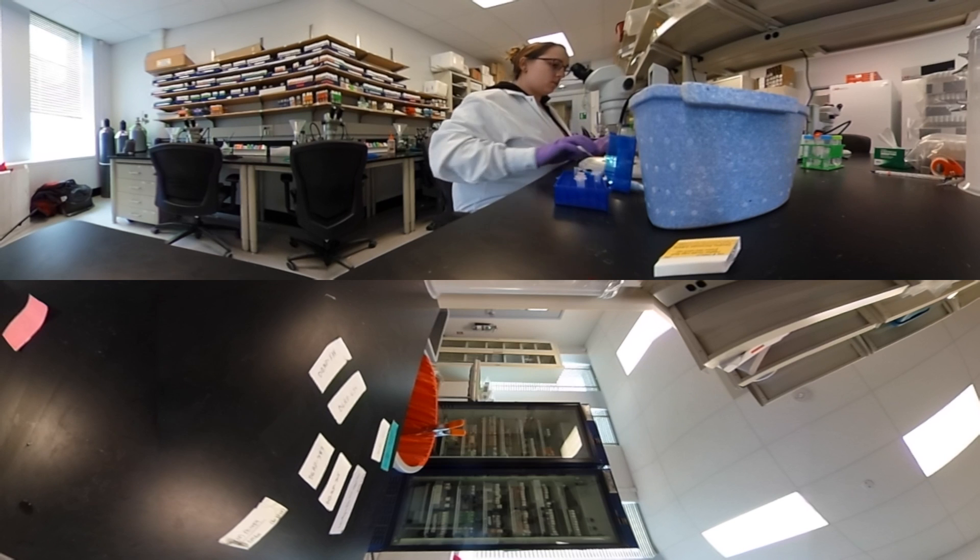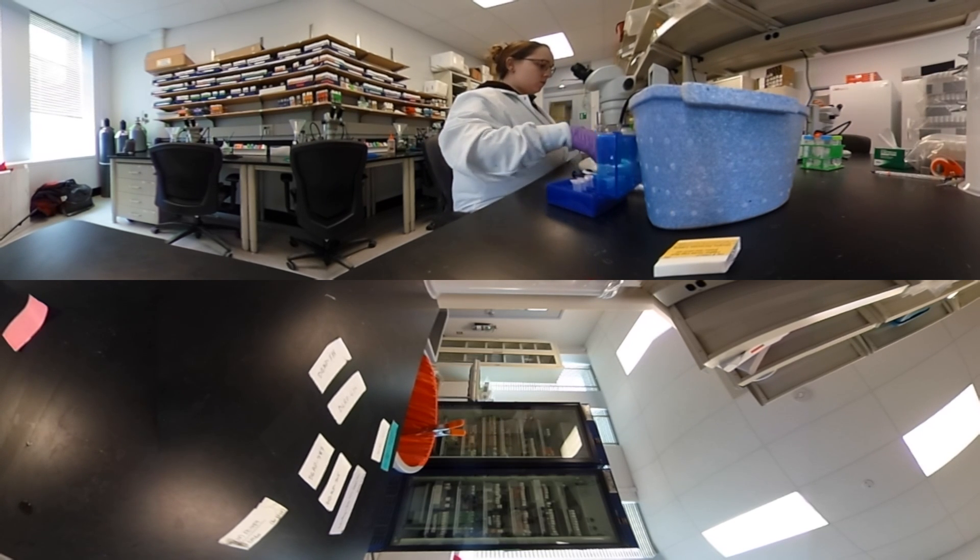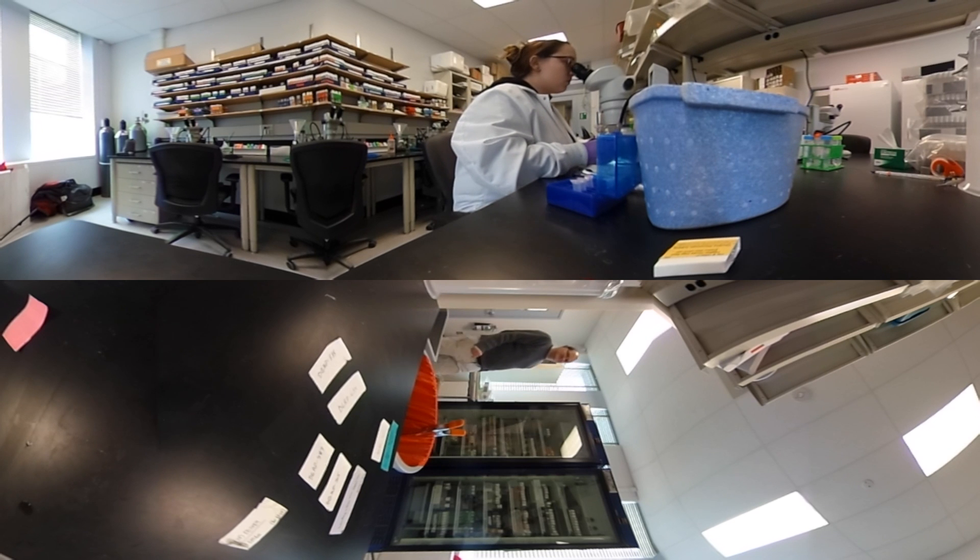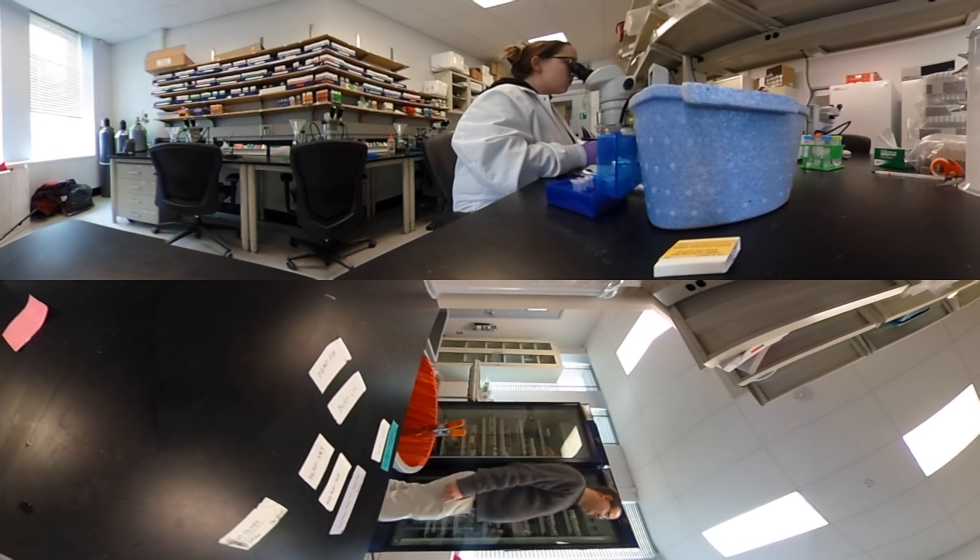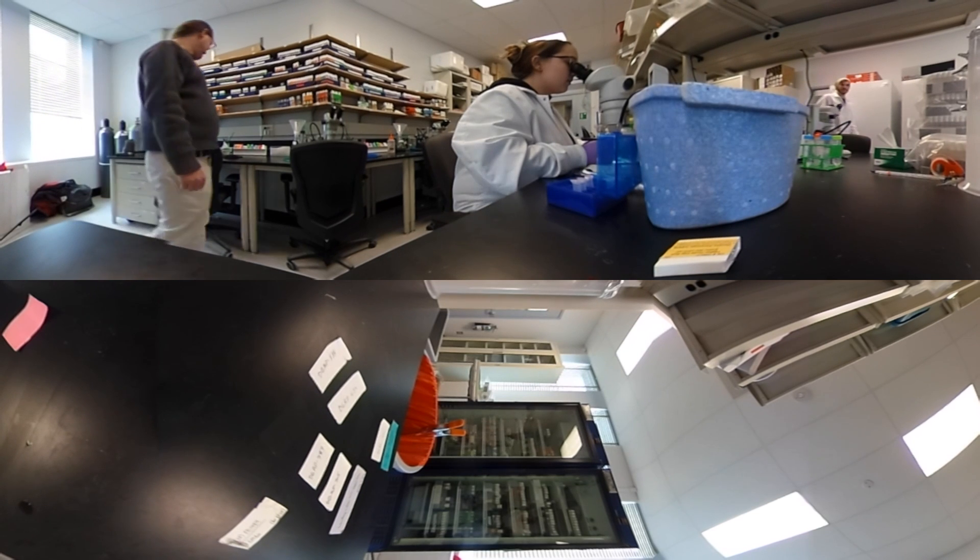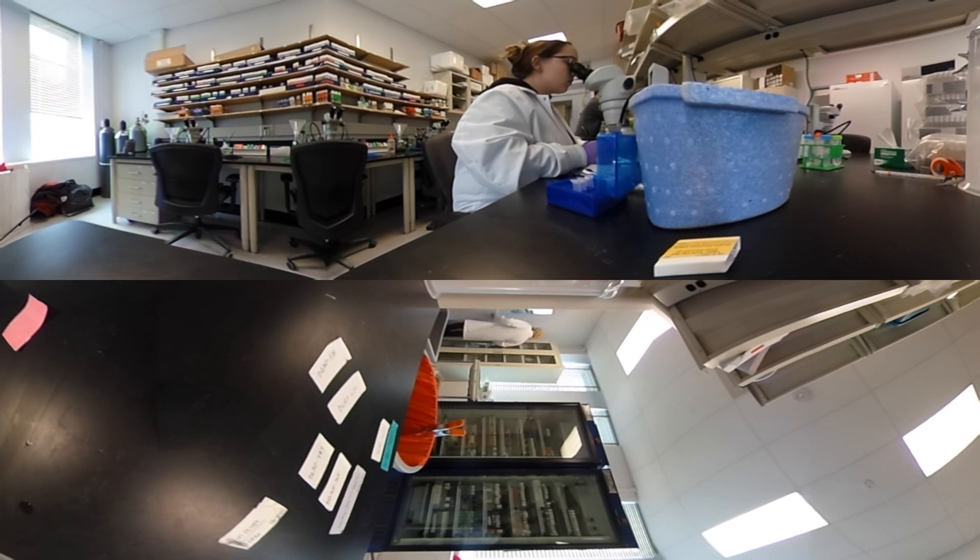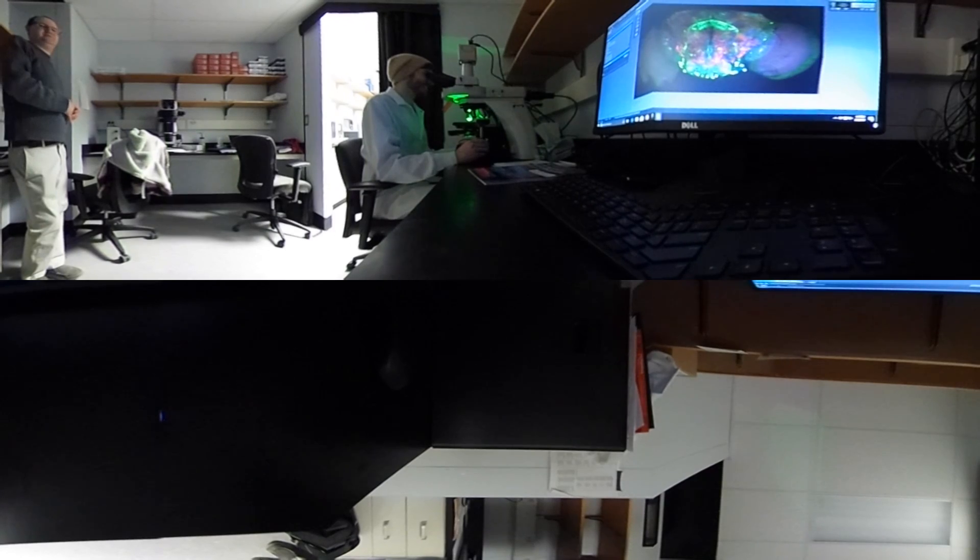It's been a dream. The lab I last came from had been around since the mid-1970s, so a lot of the equipment was older than I was. I would always tell people, as soon as I get my lab, I'm getting everything nice and brand shiny and new. And it is—it's miraculous. All the equipment is top of the line, everything's brand new, everything's clean. We're doing our best to make it dirty by doing a lot of research, but it's fantastic having that space completely designed the way we want it for workflow.